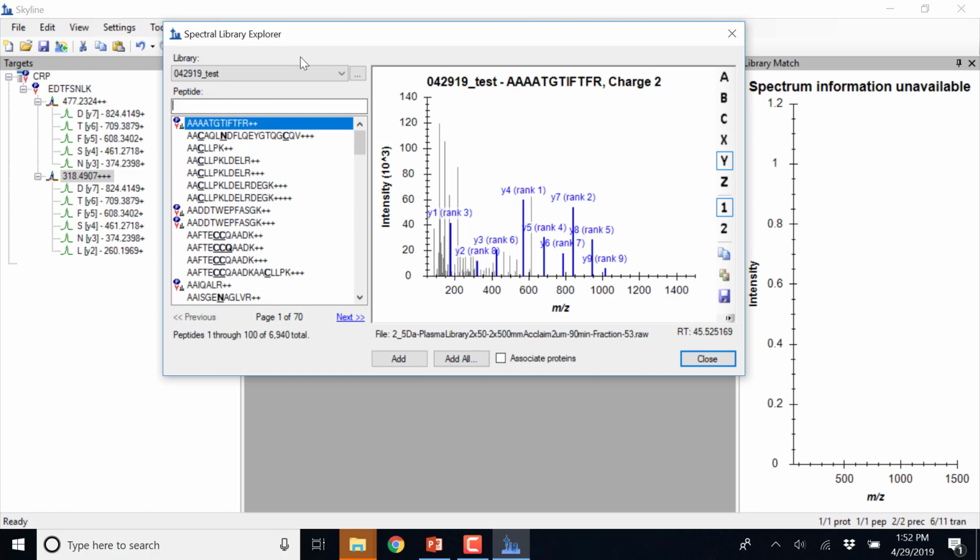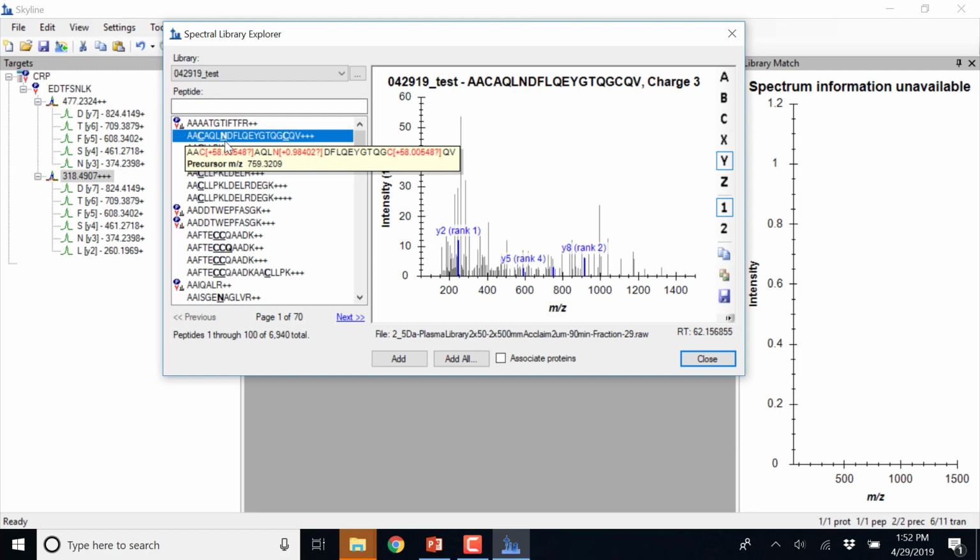Okay? All right, so right now, because we don't really have many targets over here, these are all the peptides that were identified after running the high-res accurate mass and then the database searches. So you can see that the quality of some of these is not so great. Like this is a peptide that has only a few product ions labeled.